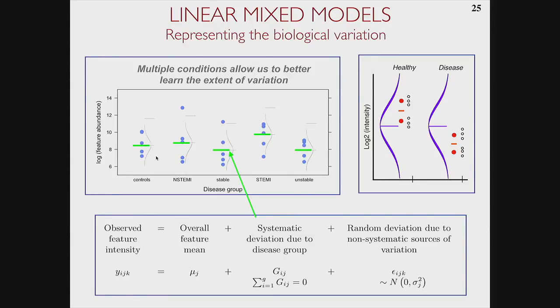And this is, so we mentioned ANOVA last time. This is exactly what ANOVA will do if you have a very perfect situation, no missing values and so on. More generally, linear mixed models learn these patterns of variation, and they inject the information on the variation from this group into a comparison of any pair of conditions.